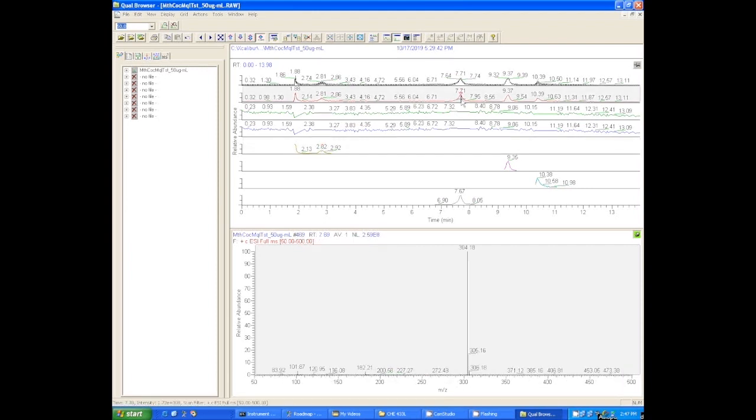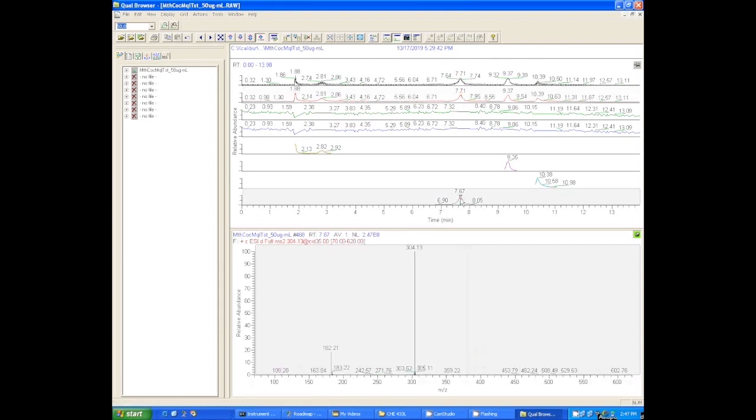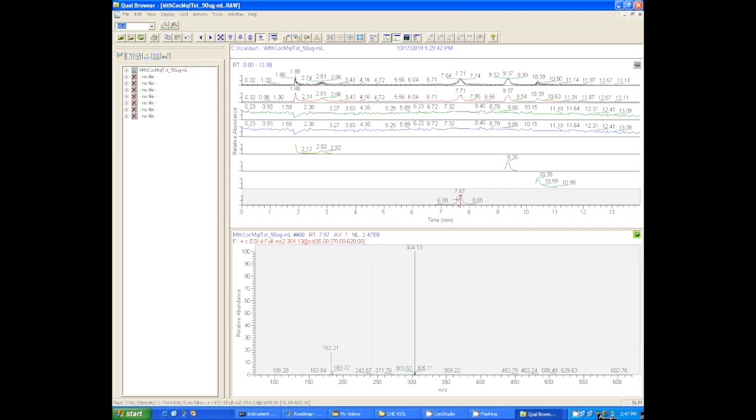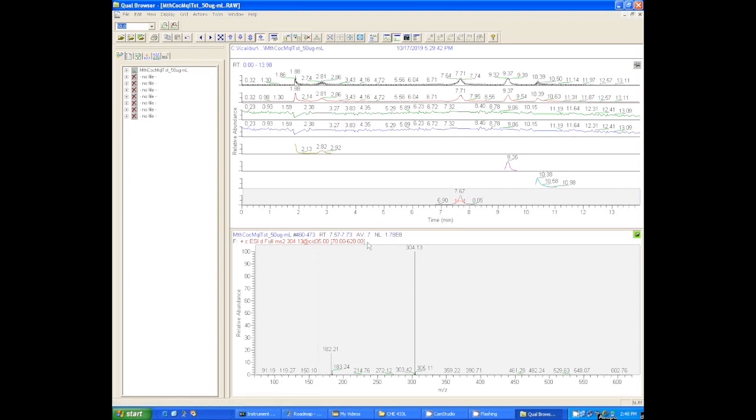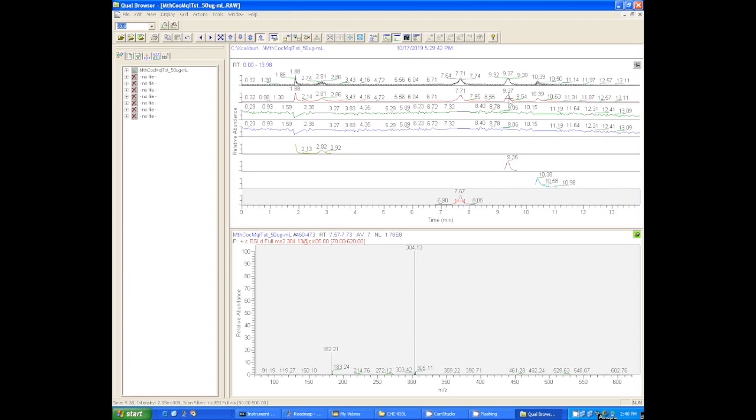We can do the same thing here for the cocaine peak. We click on the MS1 spectrum, the second one down, and we get that peak at 304. Now we go down to the bottom one where it got the MS2 spectrum for cocaine. You can see here we didn't use enough energy because we do get that 182 MS/MS peak, but we still have a lot of that 304 left over. So it might be smart to go back and increase the MS/MS collision energy a little bit more.